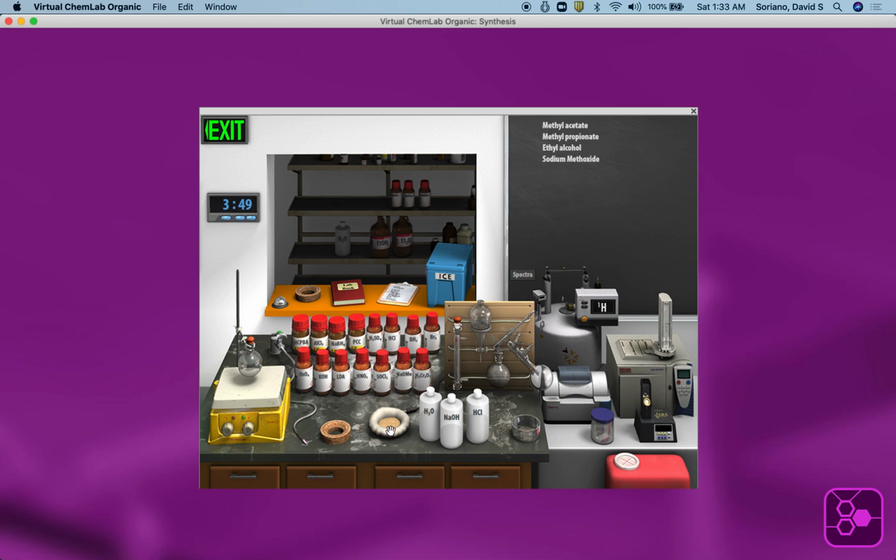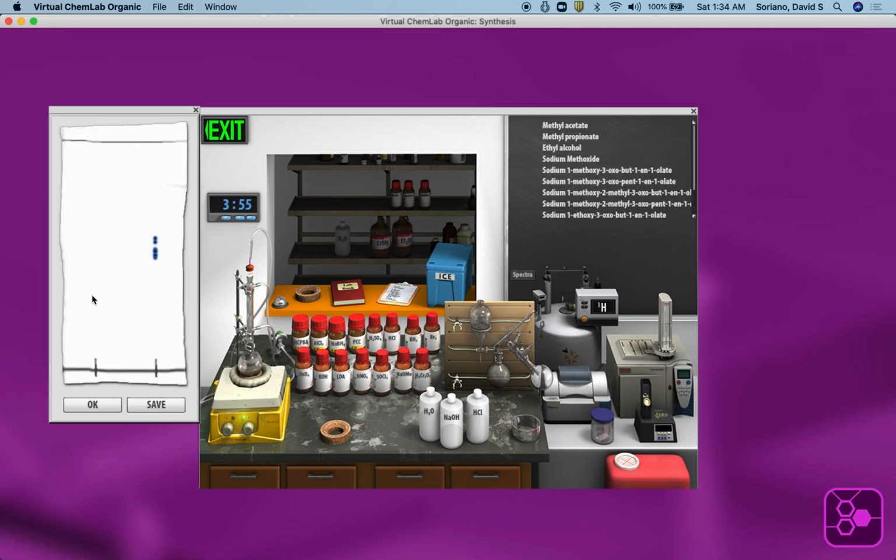We're going to need a heater and a reflux condenser, nitrogen gas, and we're underway. Note the time on the clock. Let's do a TLC at time 0. There's a notebook up there. We can record that. And we can see we're already getting reaction from the TLC. And over there are the components, reactants, products.